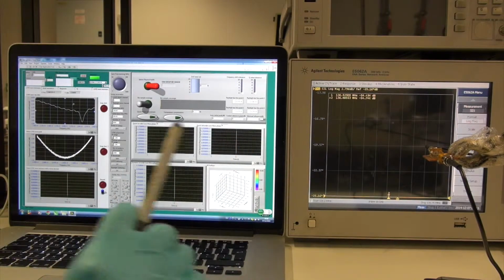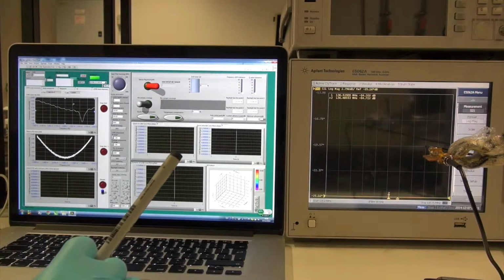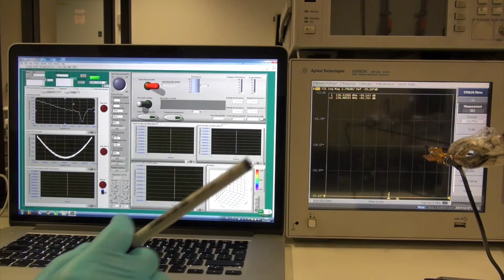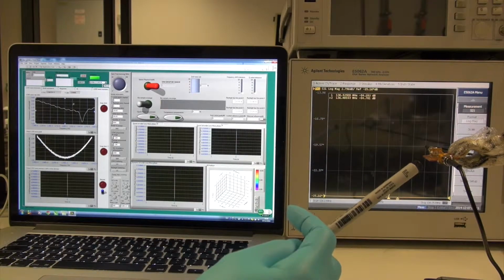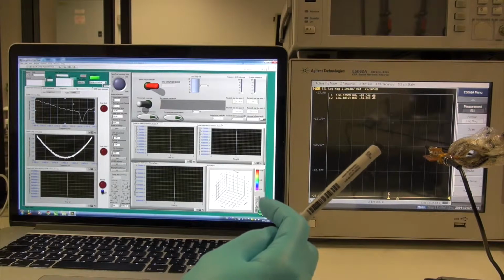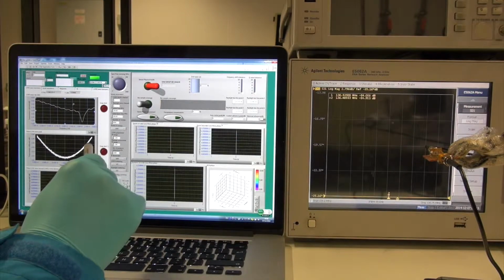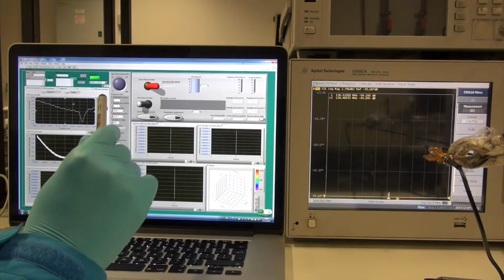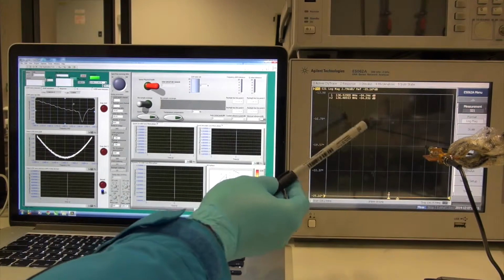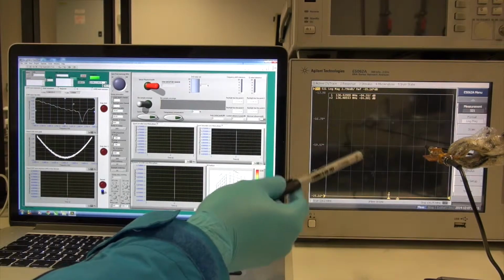This is the full system setup for optimized device measurement and analysis. This is our device, which is specially configured for biosensing in liquid environment. And this is the user interface. It's actually a measurement and diagnose system rather than only a user interface. And this is the network analyzer, which is the backstage for the measurement.